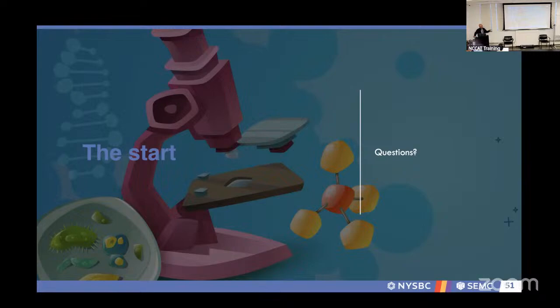You can take the same grid and collect a small data set on all these microscopes. If you have a very normal, typical sample, it's usually the sample that's limiting, because you'll get very similar resolutions. If you have a very good test sample like apoferritin, you can start seeing the differences. So if you want to compare the different detectors and setups, you would want the same standard sample to go through. So for your question, what was it specifically?